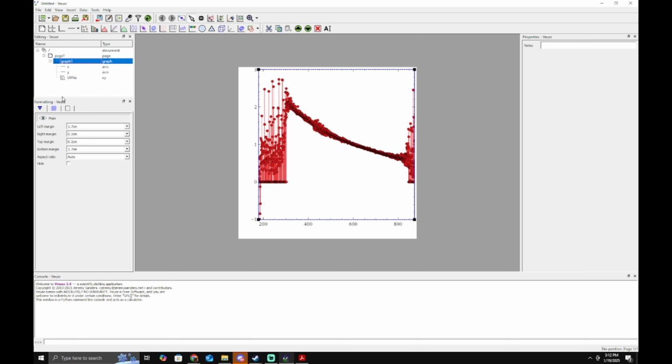And next we're going to go to the graph and change some things. So we're going back over to the formatting. Same thing, we're going to hide the background, and we're going to get rid of the border. And you can set this as default if you're working on multiple things in your document, so you don't have to do it for every single graph.